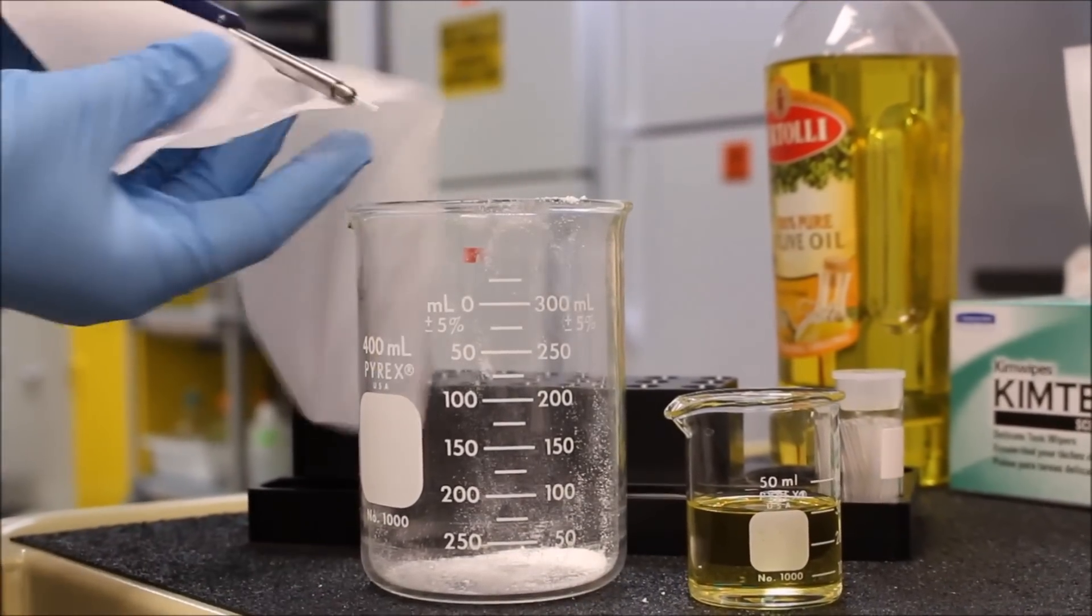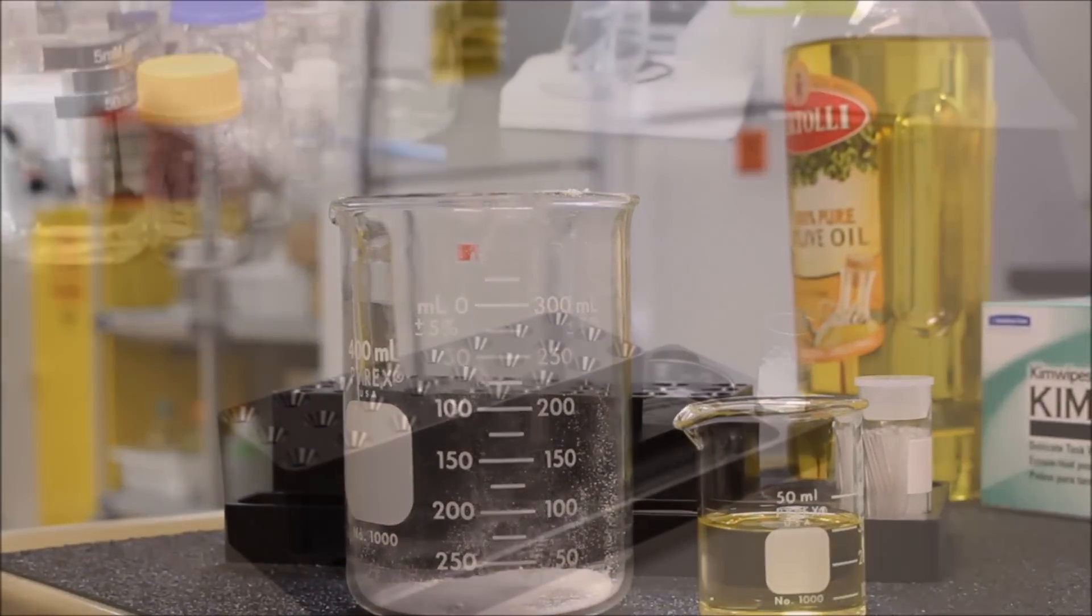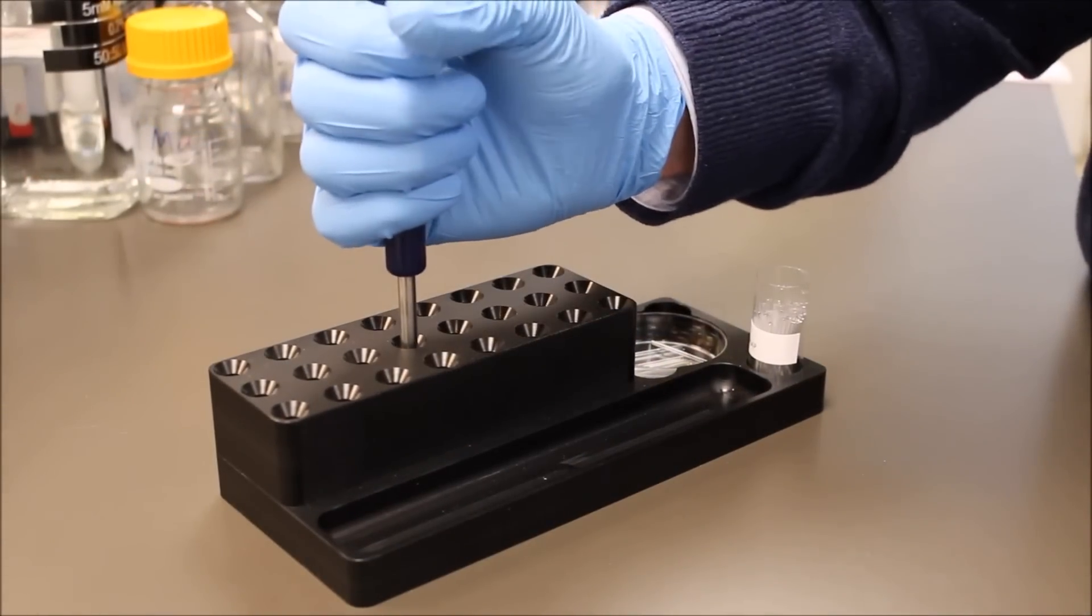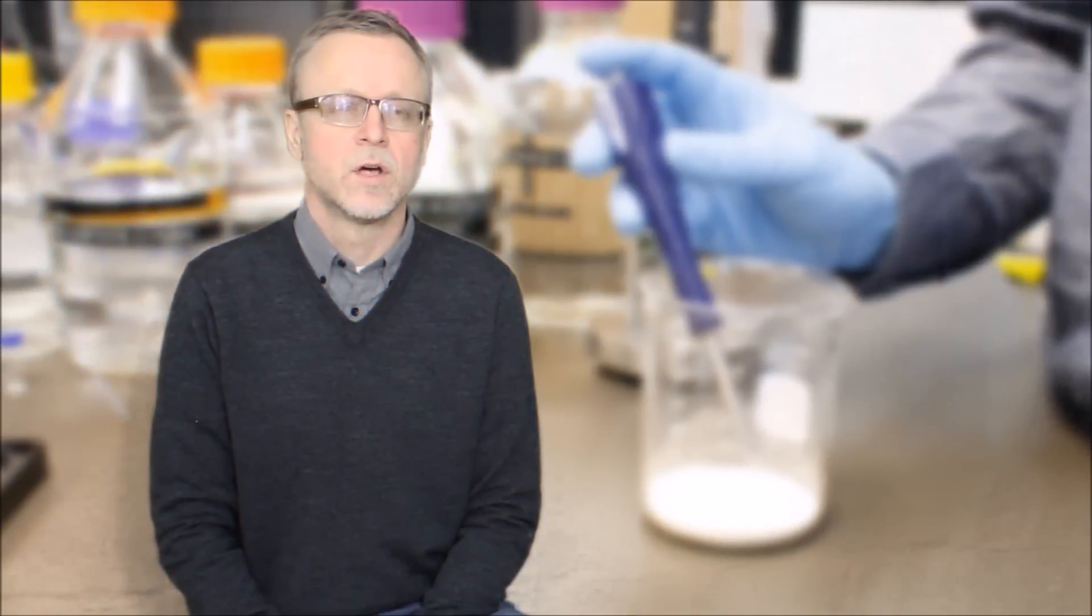Cleanup and analysis is a single step. You are then ready for your next sample. Simply clean the capillary or use a new one. No more waiting, just fast analysis on the bench.